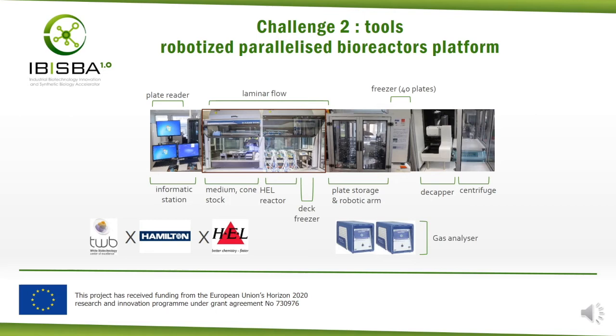When the number of strains is lower than 24, at TWB we use a custom platform, a robotic bioreactor platform, in order to test strain and bioprocess pairs, with data collection about bioprocess variables, for example, temperature control, pH control, oxygen transfer, the strain fitness, growth rate, viability, respiration rate, and with different process conditions, and with sample collection for metabolic pathway health evaluation.